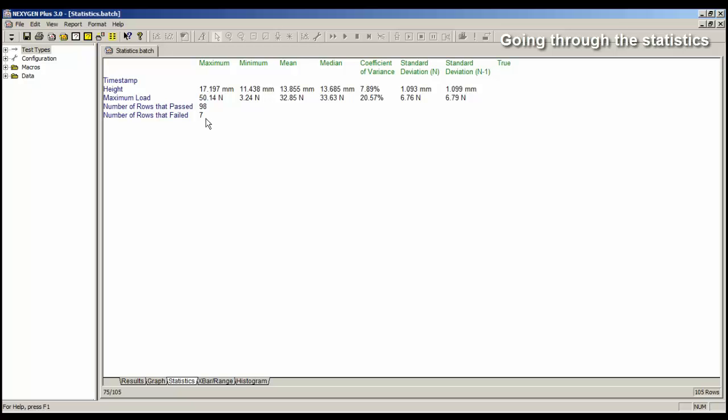Now 3.2 Newtons is very low for my product, so it could be that there was a system failure and not a product failure. For example, the sample slipped in the grips. So I don't really want that sample in my statistics. Now we can exclude them, and we can do them individually, but it might be easier to do it as a group.